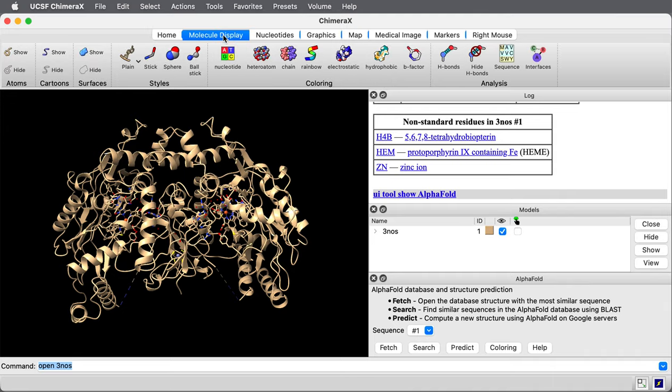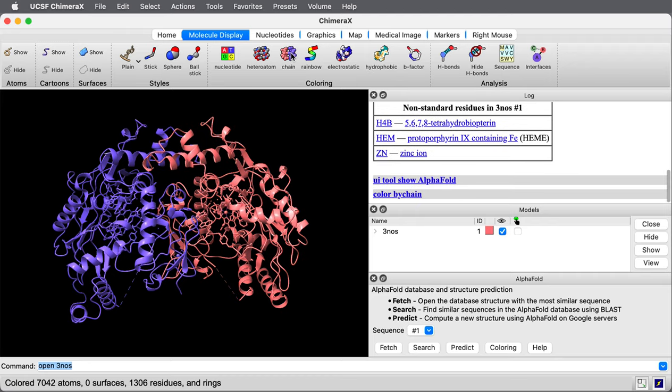Let me actually color those two chains just so you see the dimer. Those are the two chains. Back to the AlphaFold dialog.